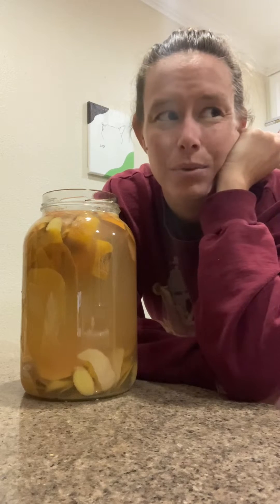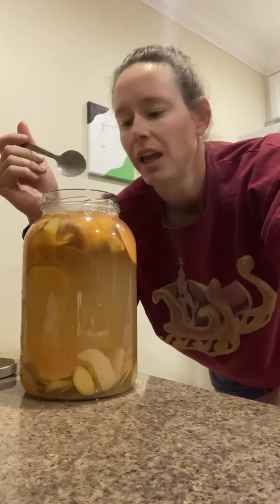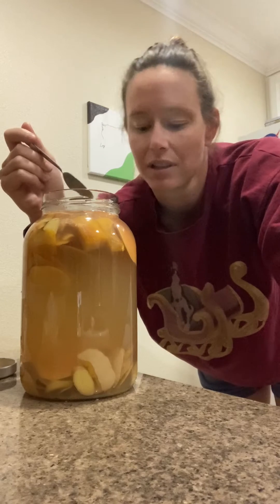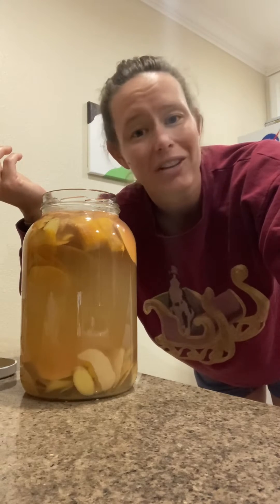Maybe some apples that have really gone bad too. At the beginning this smelled really, really nice — I was really excited about it. It smells bad, and I want to know what's responsible for this gloopy, stinky mess. So let's put it under the microscope.